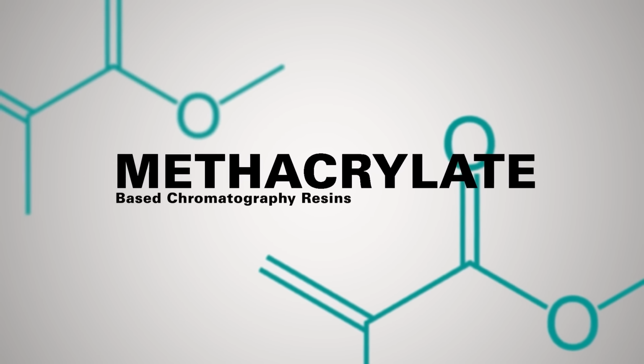For example, at Toso Bioscience, the polymer we use to make these beads is methacrylate. With methacrylate, you can make big particle sizes and small particle sizes, and they all have different functionality, so they can capture the molecules of interest as the customer or scientist needs.